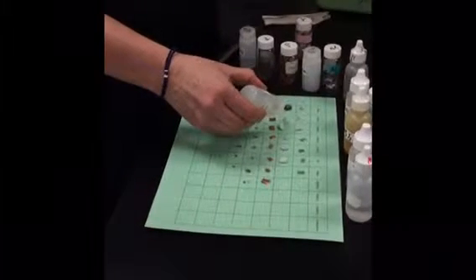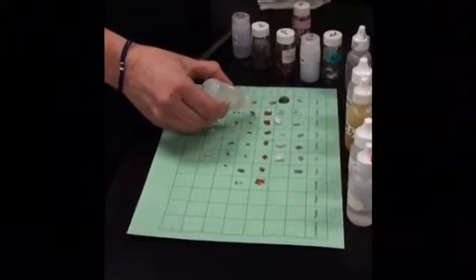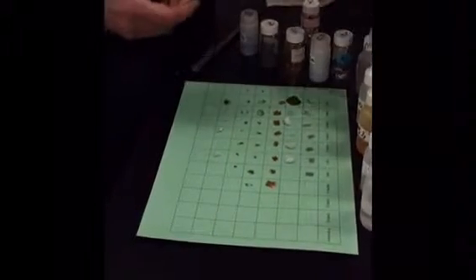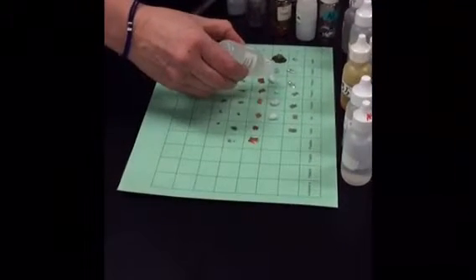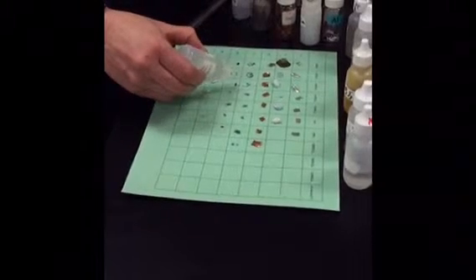1 or 2 drops should be sufficient in each case. You don't want so much solution that your reaction moves out of the box. That's pretty exciting. And you're going to continue with each solution through each column.